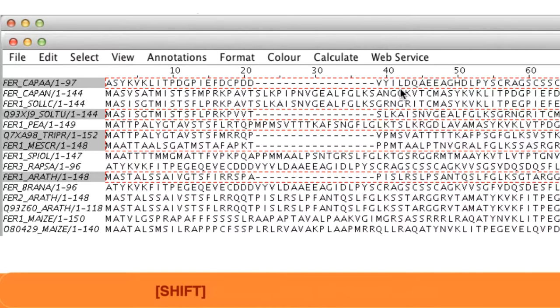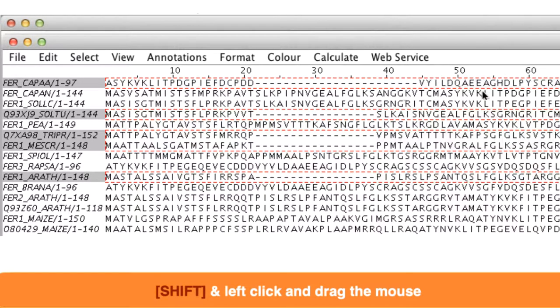If I hold the shift key rather than the CTRL key, then gaps are inserted only between the residues in the sequence on which the cursor is located.